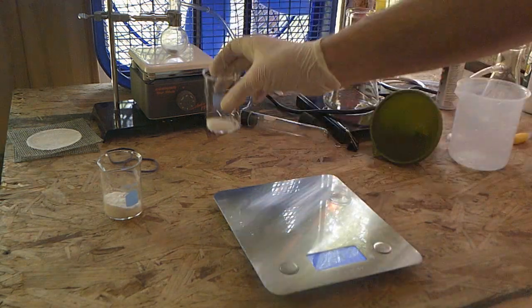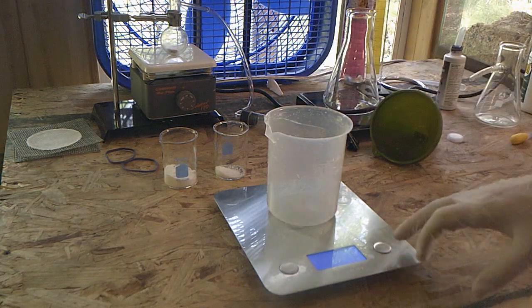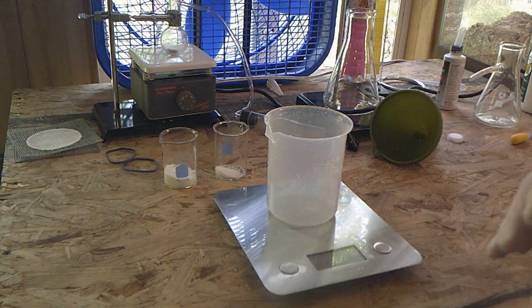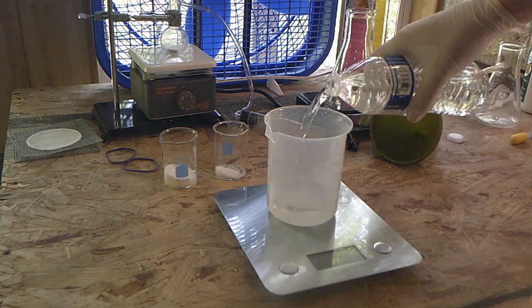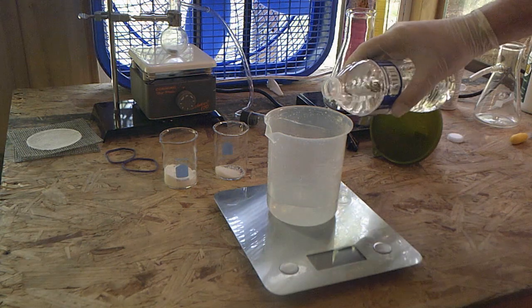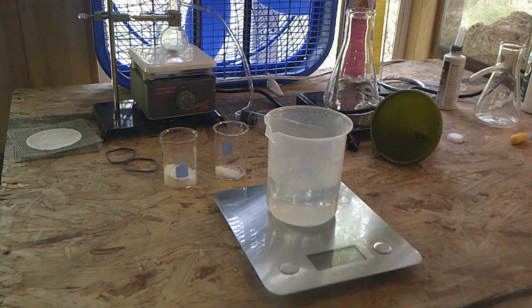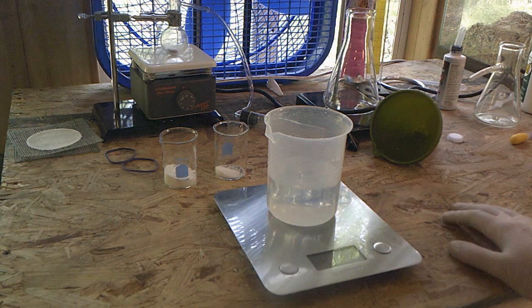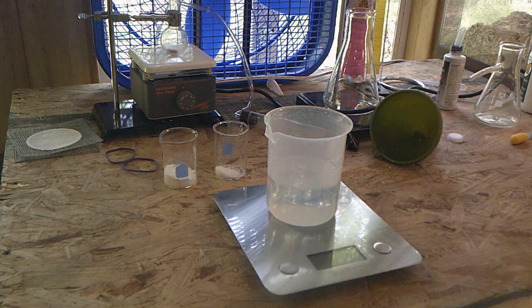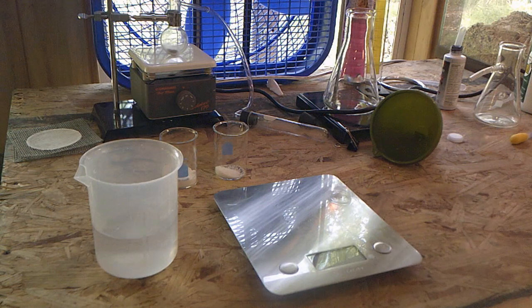And then we have sodium hydroxide and dextrose, and now we need just some water, right? We need some water to create a solution. I can turn that off. And we're going to do about 300 milliliters of water, or about 1/3 of a liter. There we go. And what the water is going to do in this is, we've talked about how with acids you form hydronium ions. Water is kind of the vehicle that allows you to transport these hydrogen ions in solution. So it's what allows kind of acids and bases to really do their work.